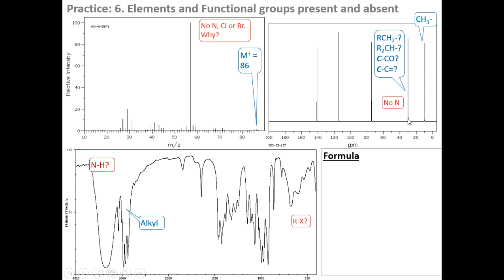This one's quite downfield, so it could be a variety of things, but we know that that methyl definitely shows, there's that alkyl over there. Right, we do have this lovely little peak over here, which is a hydrogen bonded to a carbon of a double bond alkene, and we have the alkene peak. Remember, narrow, medium peak, unlike the carbonyl, which is a strong finger-like peak. We can also see that we have an alkene because we have these peaks between 100 and 150.